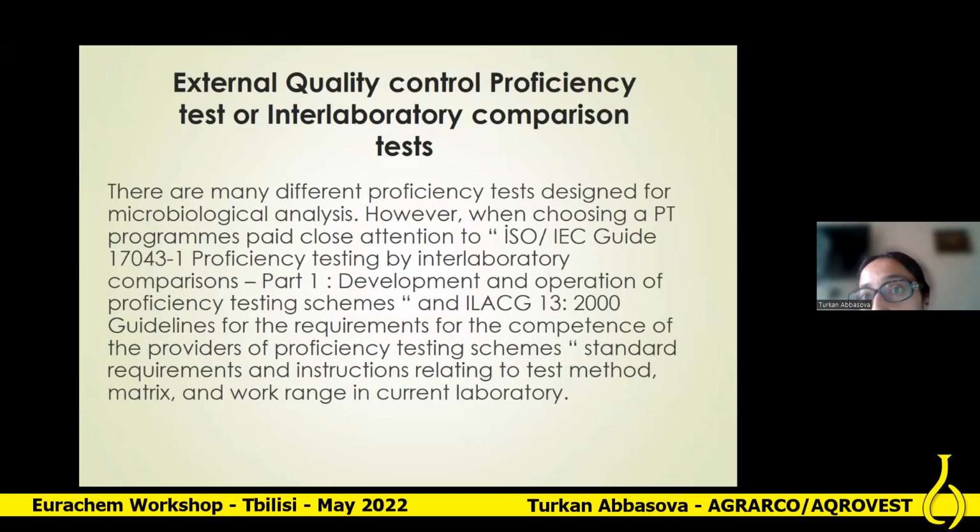And external control, proficiency test. External control includes the proficiency test and interlaboratory comparison tests. Before, my colleague Mr. Brooklyn informed us of very useful, very important information about proficiency test providers, etc.